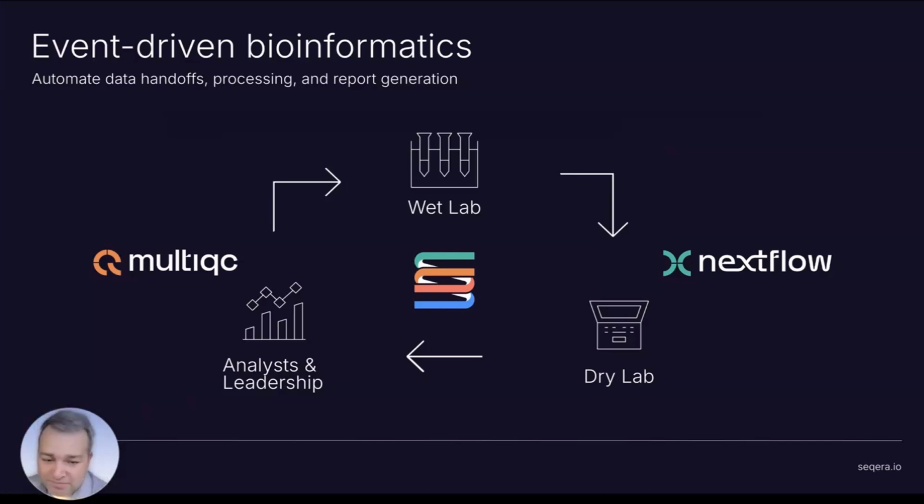Our dry lab processes, these complex scientific workflows with dozens of steps, we could instead replace with a Nextflow pipeline that handles the entire computation from beginning to end, and does so with software containers that ensure reproducibility, and having it set up on infrastructure to scale to whatever size is needed.